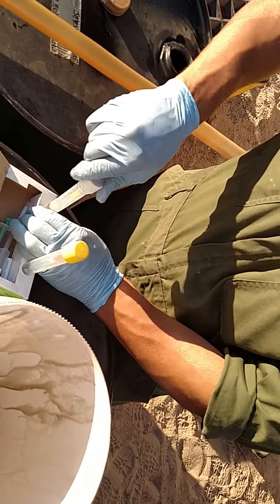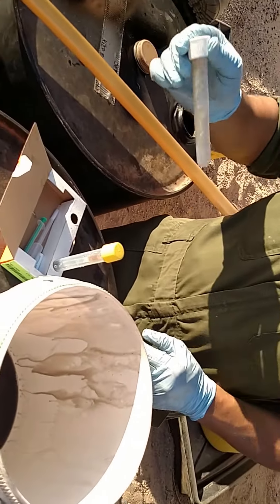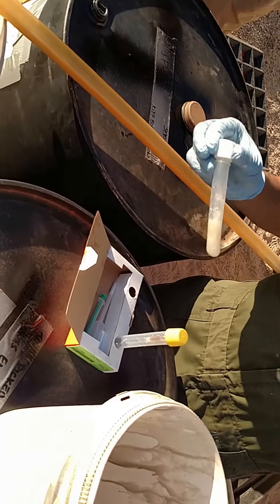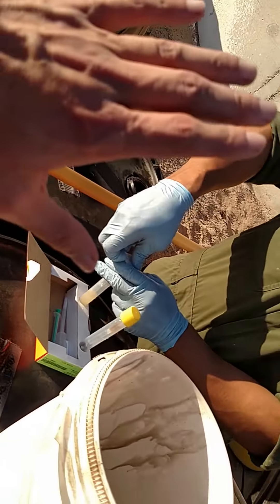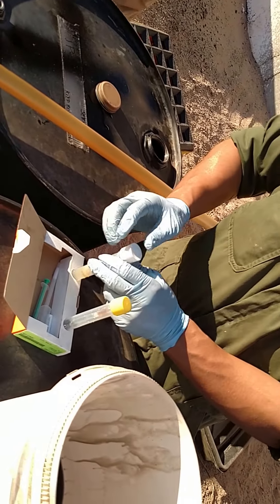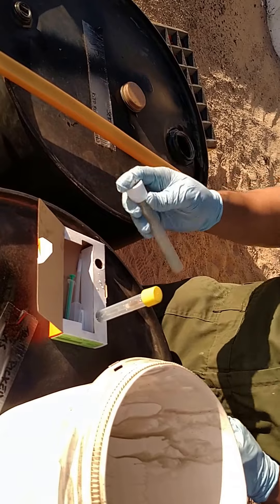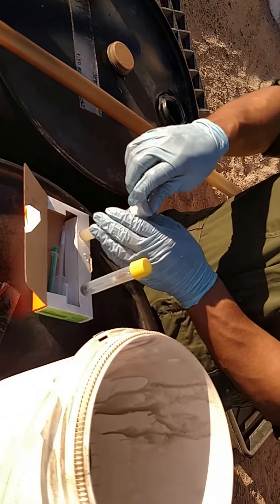Shake it for about 40 seconds and every 10 seconds vent it. There you go, don't be scared of it. This whole process is supposed to take five minutes if you're good enough. Vent it, vent it again.